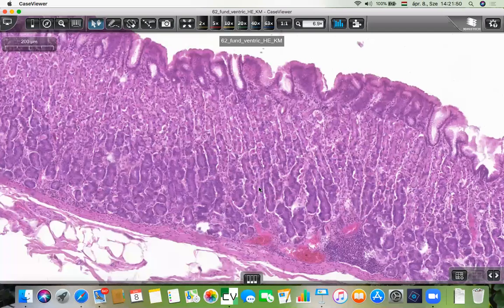In the gastric glands, we can find 5 types of cells. We have hormone-producing cells, enzyme-producing cells, other types of factor-producing cells, and some undifferentiated cells. From these 5 types, we can identify 3 types of cells because the enteroendocrine cells are not well represented.